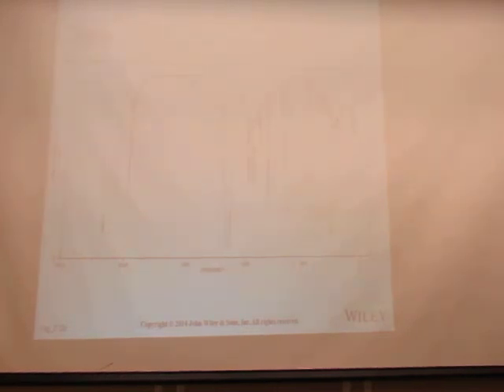If the nitrogen has a hydrogen on it. If you had a tertiary amide, you wouldn't have a hydrogen. But if we have a hydrogen, we'll have an NH stretch. And that comes at 3100 to 3450. They're normally medium in intensity, so I'll put an M out there for medium.